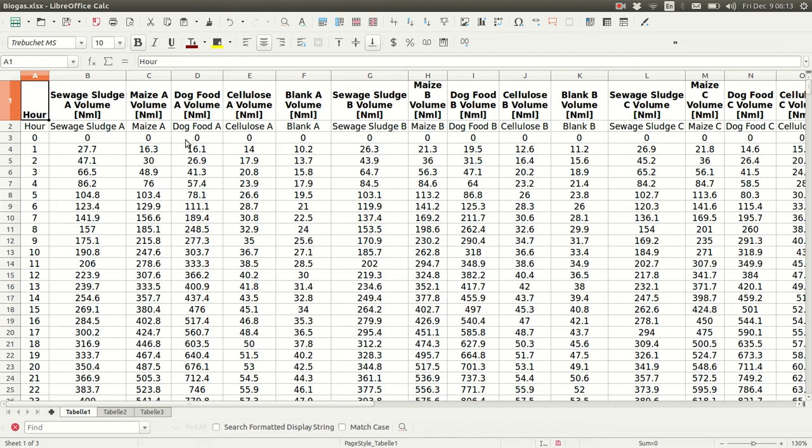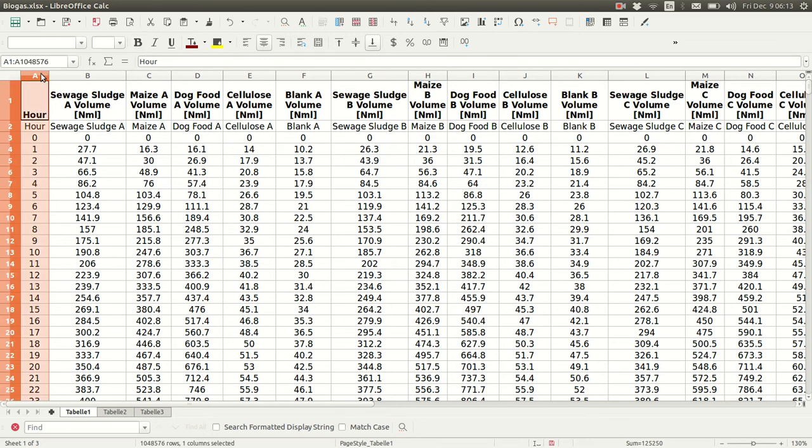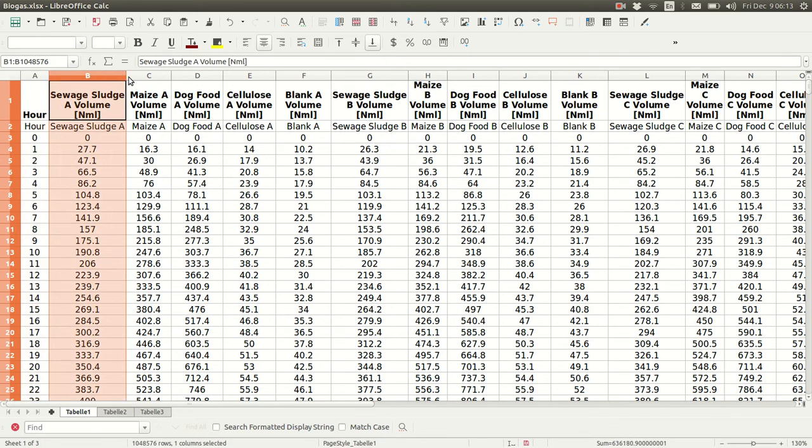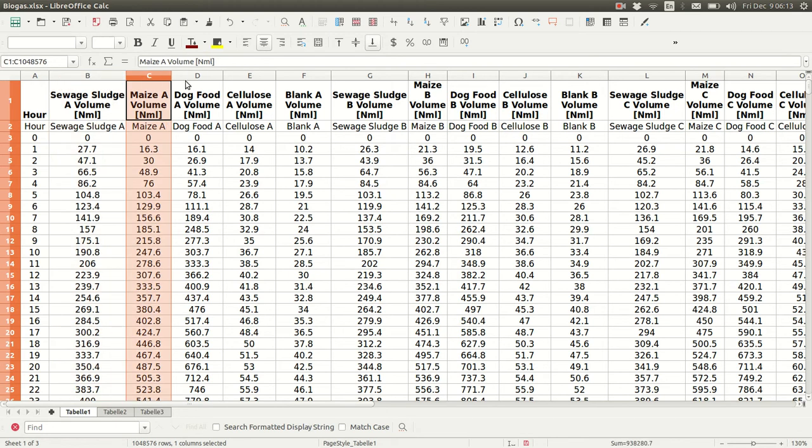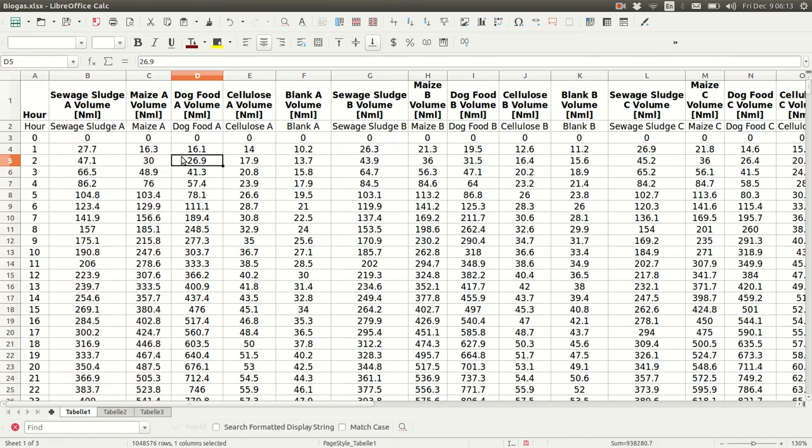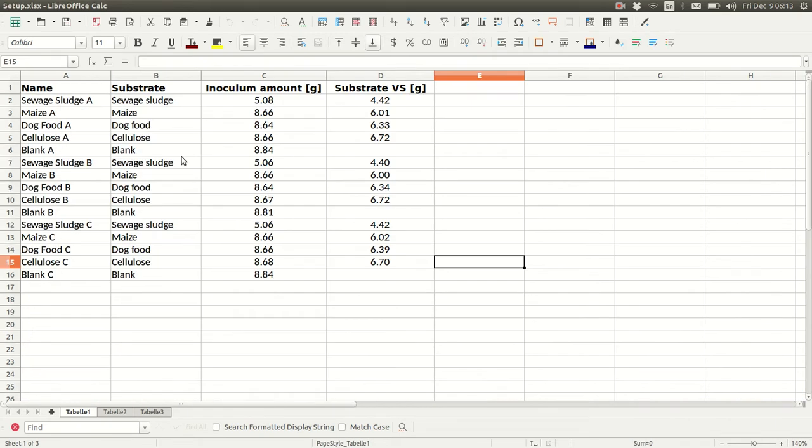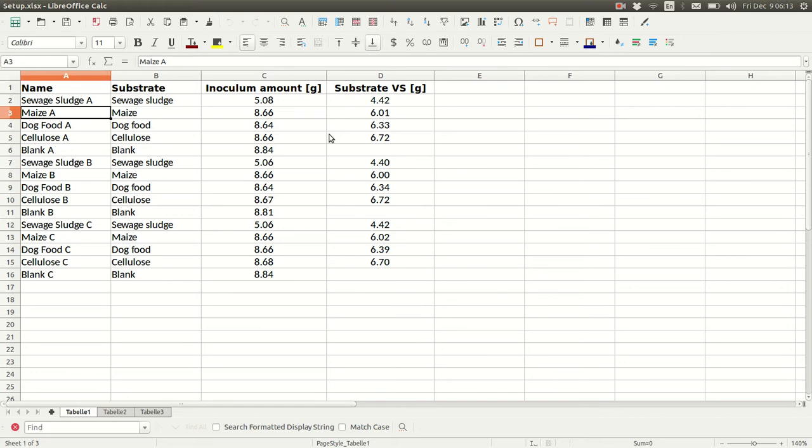AMPTS-2 data are organized in a wide format where you have a single time column here in hours, and then a separate column for each bottle. It's necessary to pull out the setup data and put them in a separate file. So here I've made a file called setup, and we need at least these four columns. Notice also that they're transposed compared to the original AMPTS-2 data.